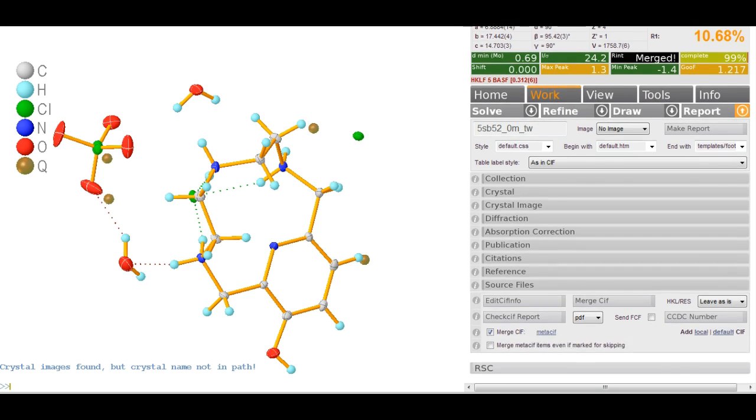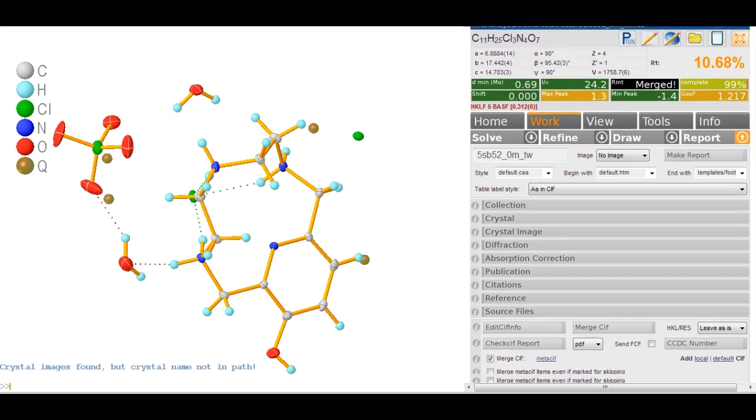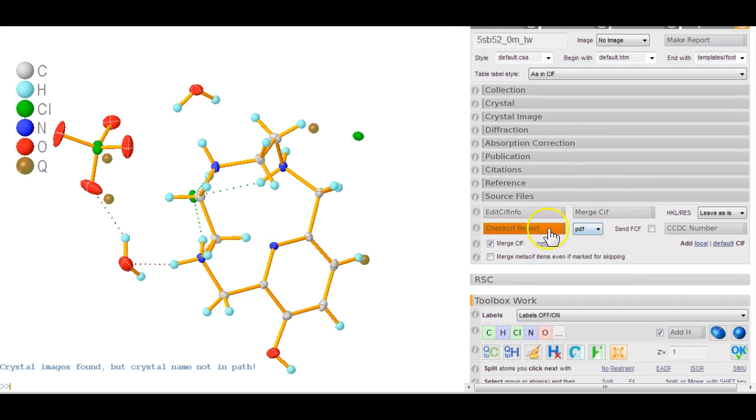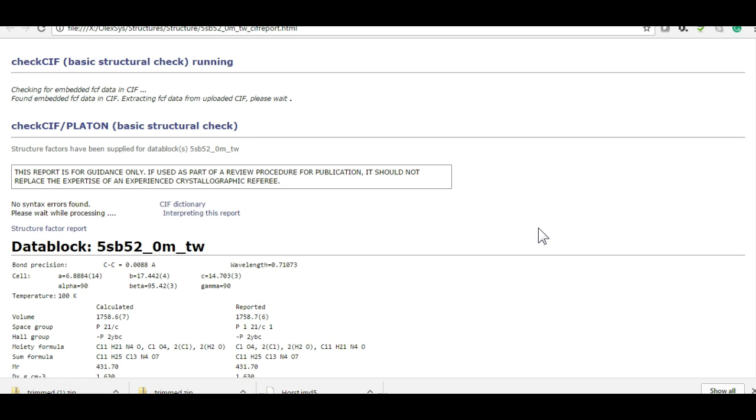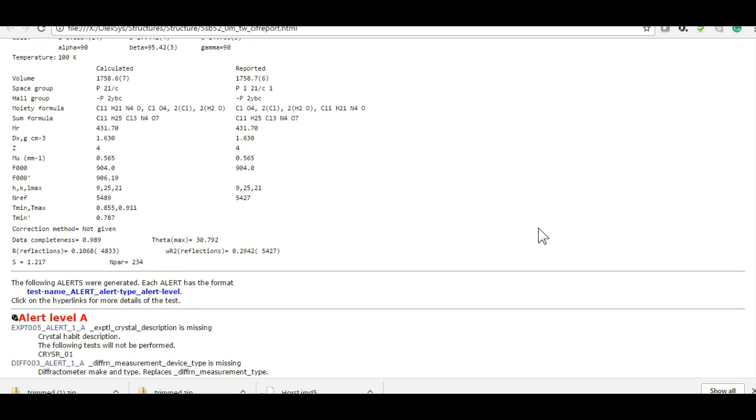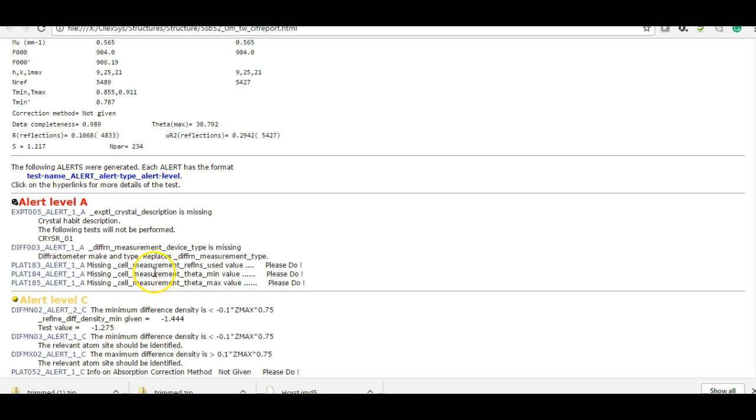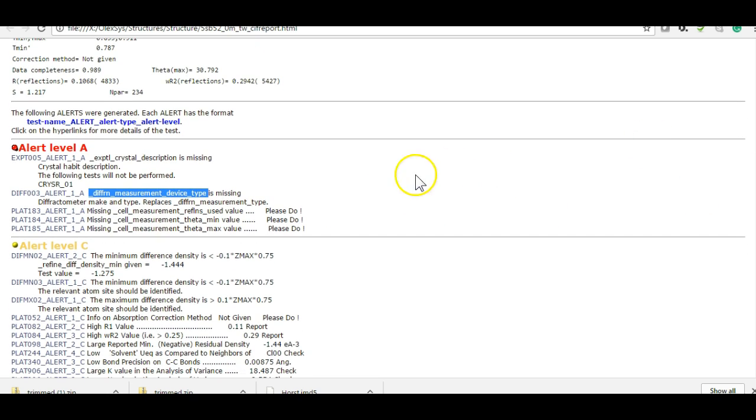You can always have a quick look at CheckCIF. So you can run CheckCIF. You go on the CheckCIF report, you can ask for a PDF file if that's what you want to do, or you can look for HTML. Let's just go for HTML here and run CheckCIF. It sends the request to the server, the IUCR server in Chester. This could take a little bit of time to come back. And here we are. So this is the CheckCIF returned and there is nothing that sort of stands out right now. The missing cell reflection, so there's no cell reflections. The device type is missing. So there's some A alerts, but these are all just because information wasn't there and I've not been provided that. And there's some smaller things which are down to the fact that this is a twin data set. So the absorption correction method is not given. It's essentially correct, except we are missing some metadata that should have been there.